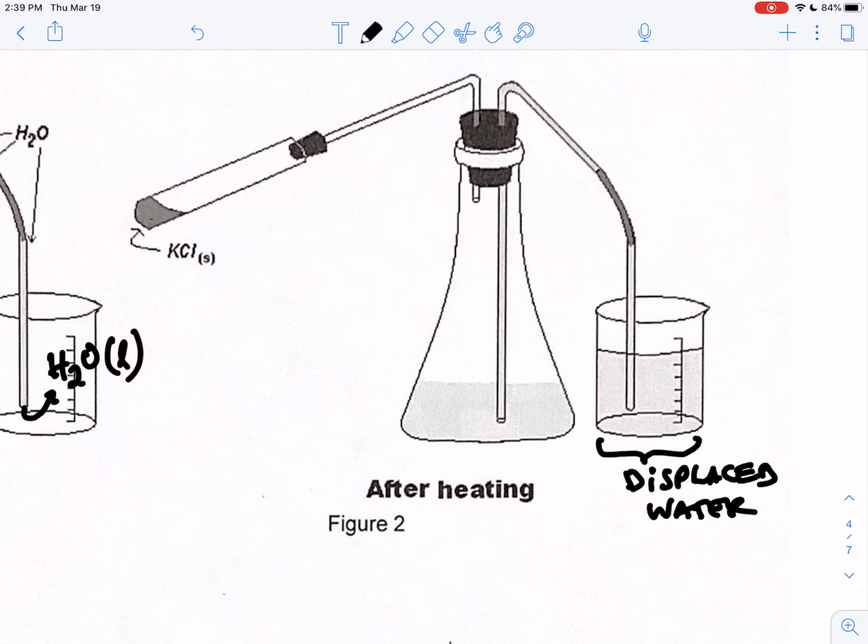But we're going to have to figure out a way of measuring the temperature of the oxygen that's going to be inside the flask, and also its pressure. We don't have a way right now of inserting any kind of sensors in there. So here's what we're going to do.